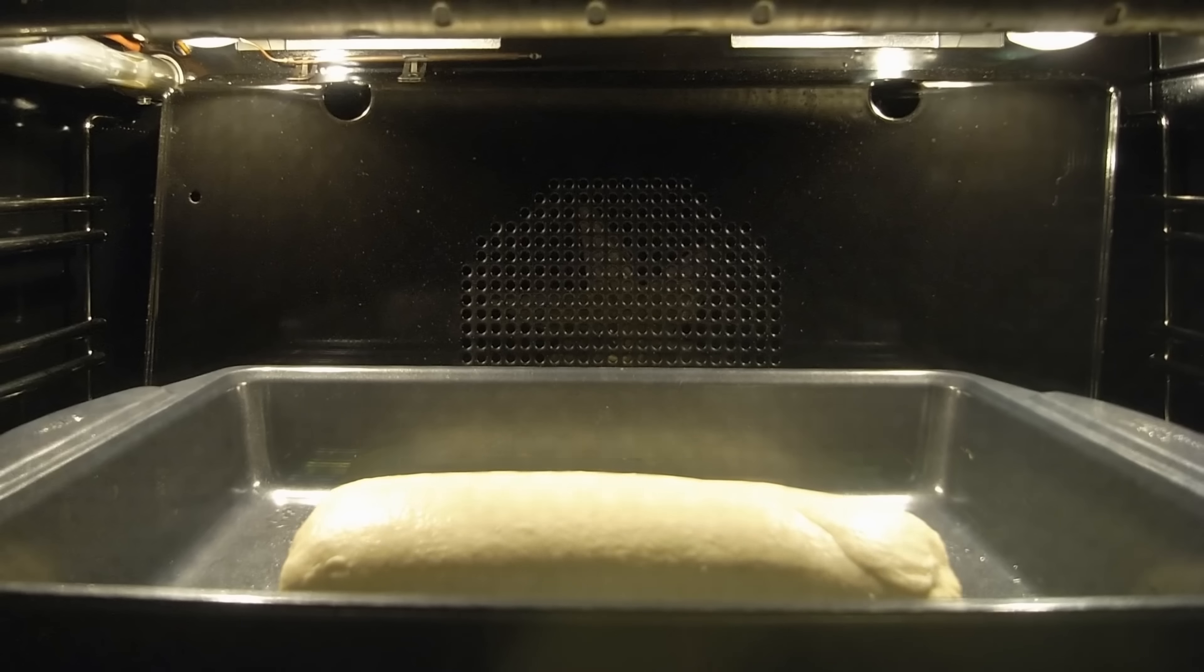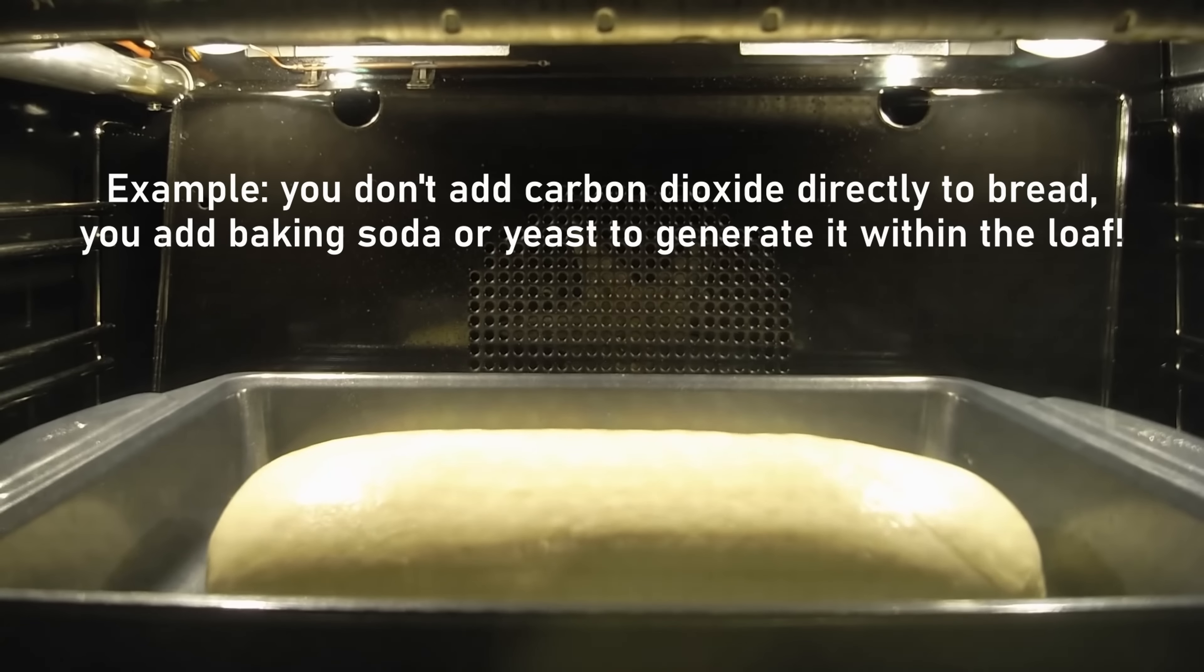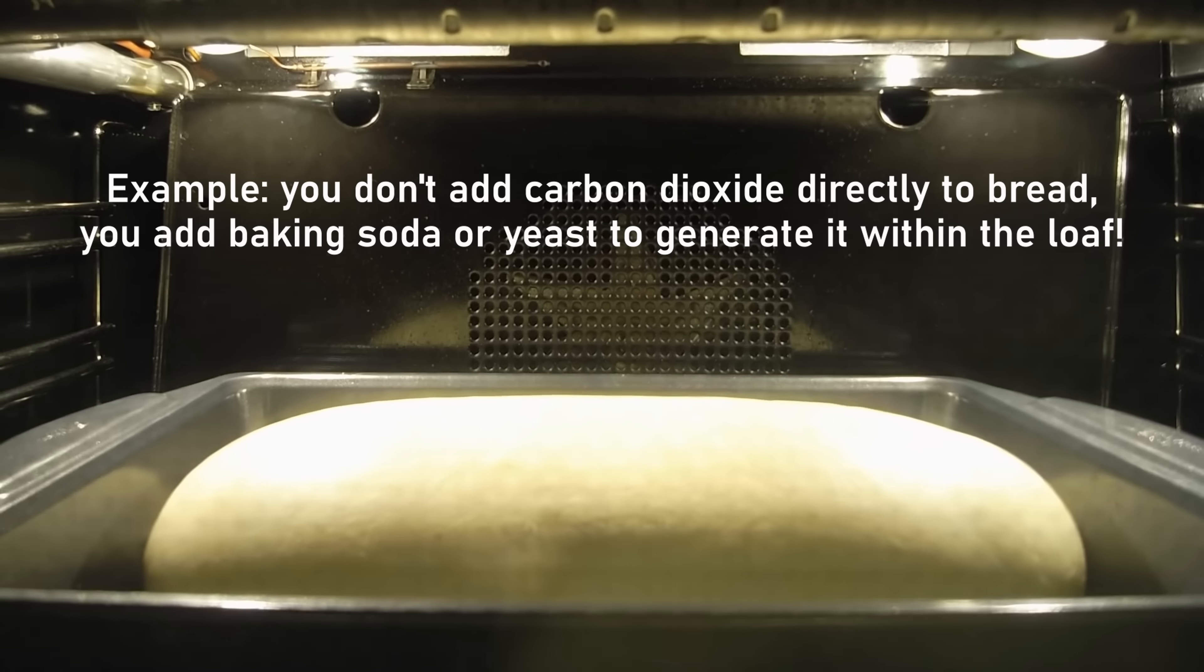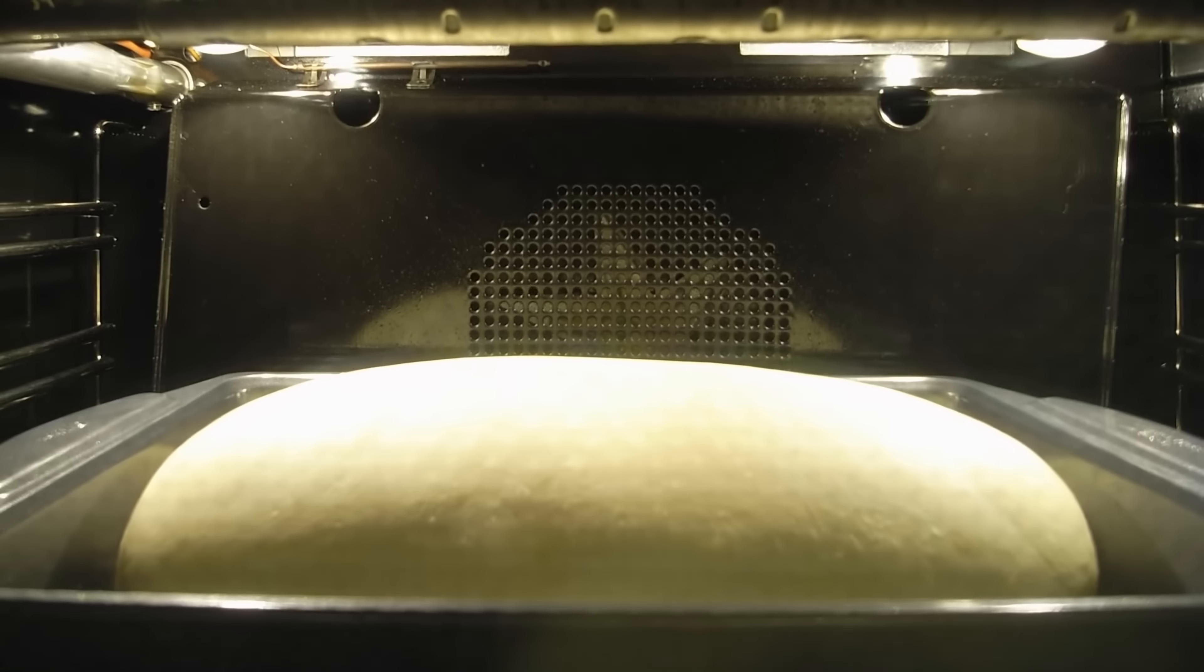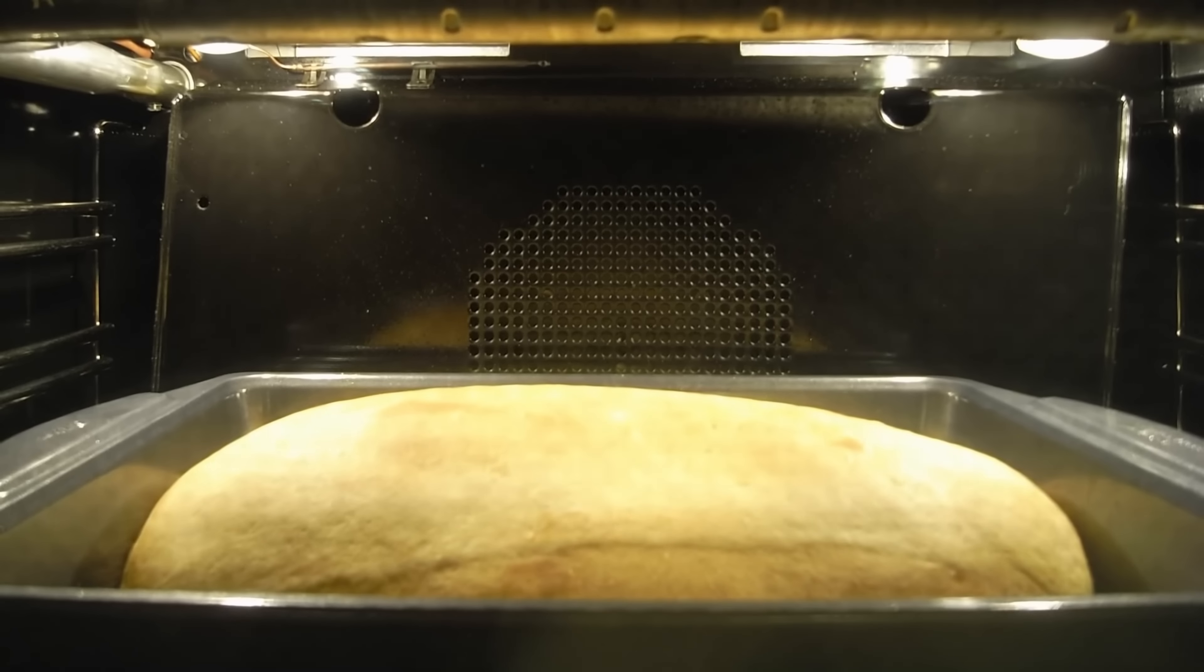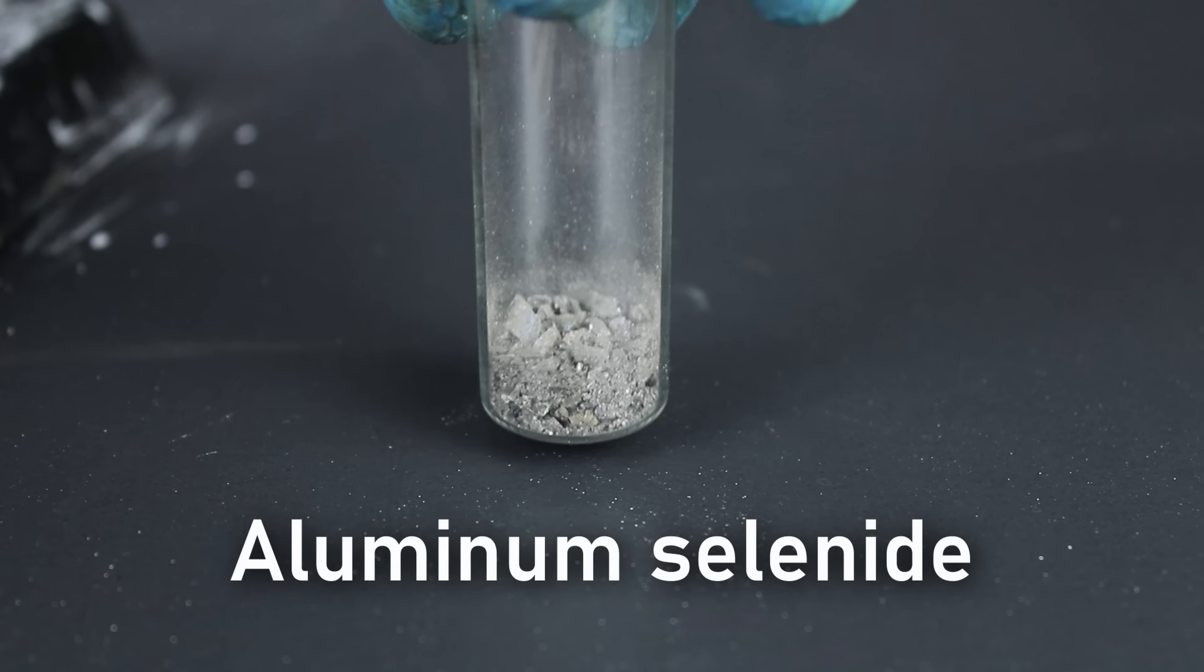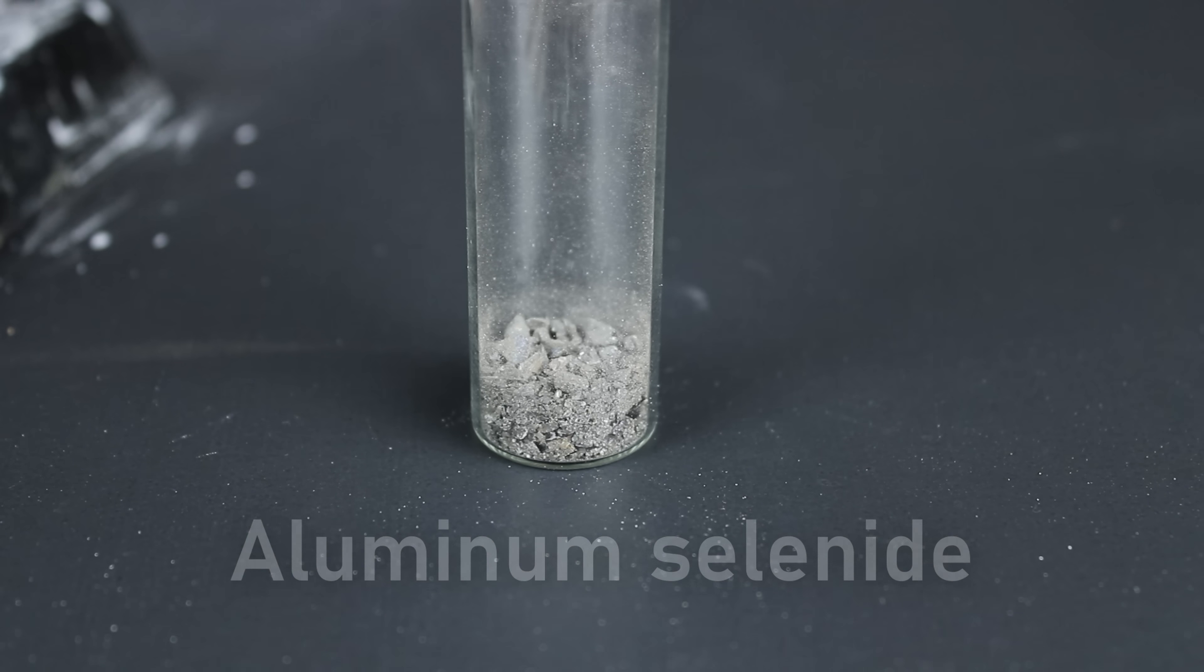So how did I get around the issue and make diselenoacetone? Two words, in situ. In situ is Latin for on-site, and in chemistry, it refers to the process of making a chemical for reaction within the reaction environment itself. In this case, we want to make the hydrogen selenide within the acetone solution, so very little has a chance to escape. And the reagent I chose to perform this task was something called aluminum selenide. This compound is fairly sensitive to water and acid, so mixing it with our solution should cause it to react and form hydrogen selenide at a fairly controlled speed.